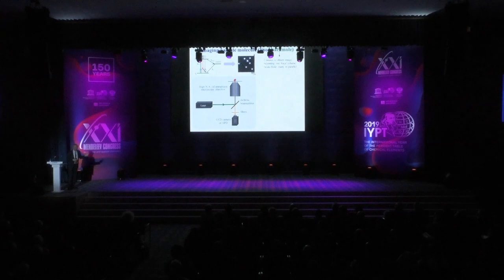And it's worth noting right here that even your own eye, you can look into my microscope and you can see the light from these single molecules. Your eyes are sensitive enough to be able to detect the light from individual molecules. Of course, we have to have the right laser color, and we have to collect well, and we have to do various things to make this work easily, but it's done now all over the world in many laboratories, including, of course, in Russia.